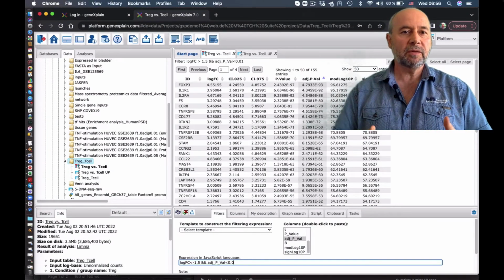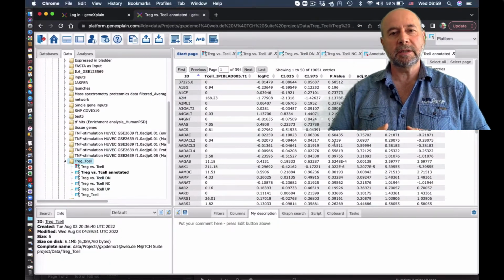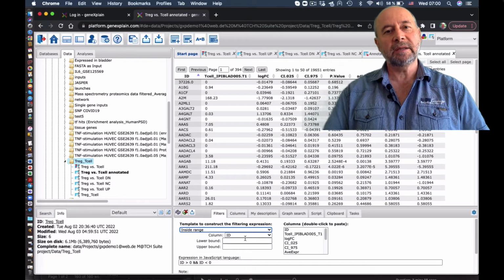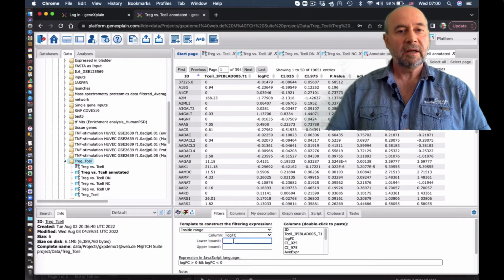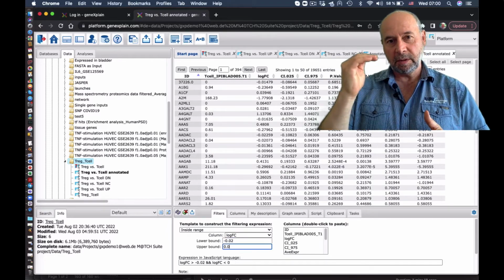The same basically we do for the downregulated genes, where we select the log-fold change below minus 1.5, and the most important, we select the non-change genes. For that, we find those genes whose log-fold change is around zero.